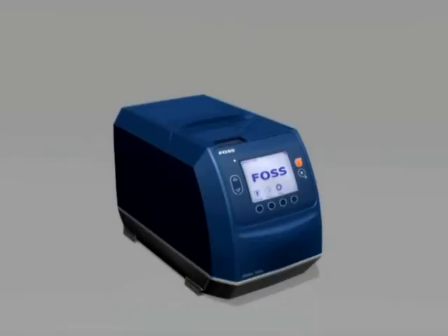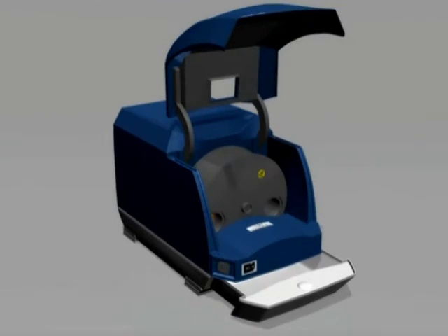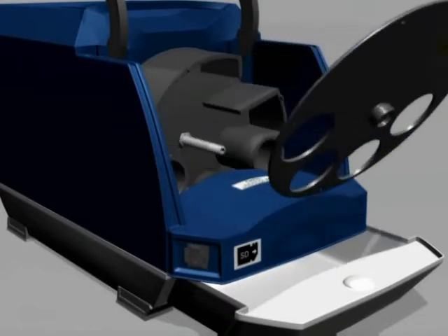To change the sample cell while the instrument is powered off, pull out the sample drawer and lift the instrument hood, exposing the sample handling wheel. To access the commodity sample, the front cover of the sample wheel should be removed. The cover is attached to a tightened nut, so it is removed when the nut is loosened and the cover is lifted away.